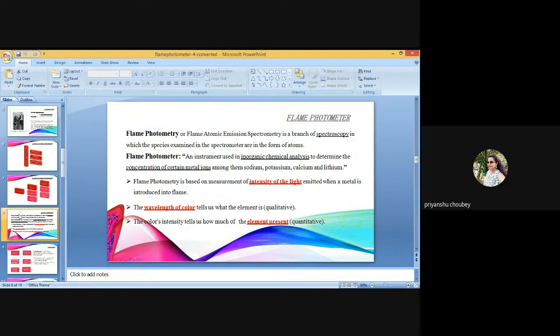decompose or explode. Never run the nitrous oxide acetylene flame without a red feather visible or with less than 5 flow units of acetylene. Do not leave uncovered containers of volatile organic solvent near the uncovered flame.